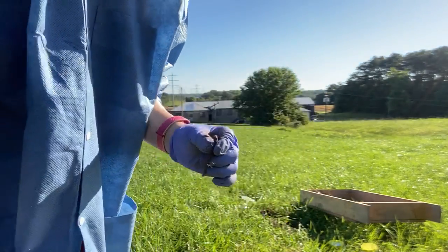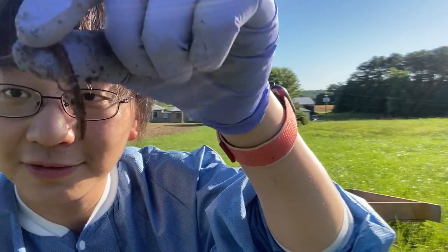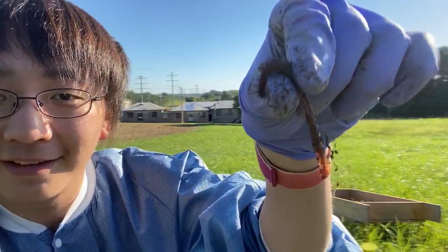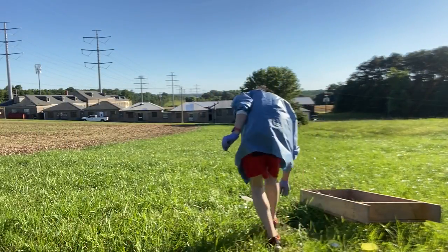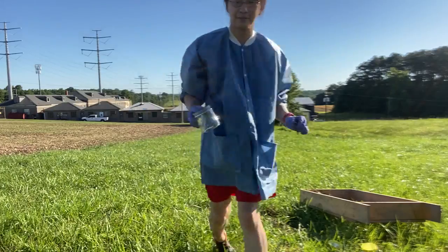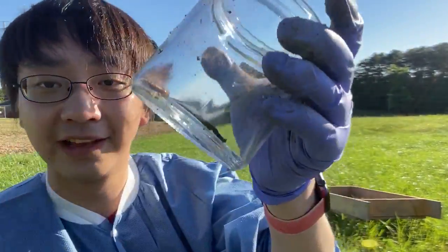So basically we dig the soil and separate it apart, and then we can look for earthworms like this, and collect the earthworms in a jar.